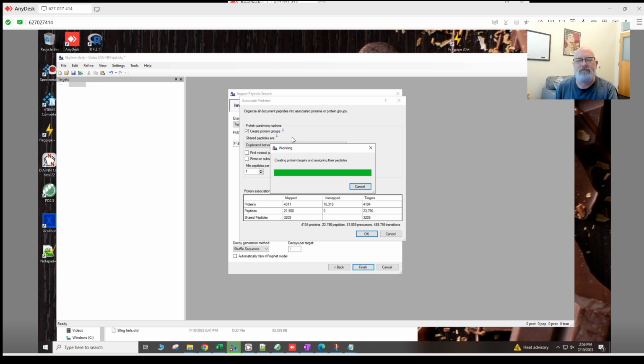Okay. All right, so now we have 4,104 proteins, and we're going to find the minimal set of protein groups that explains all peptides. Let's do that. That sounds cool. Okay, that's going to take a minute.